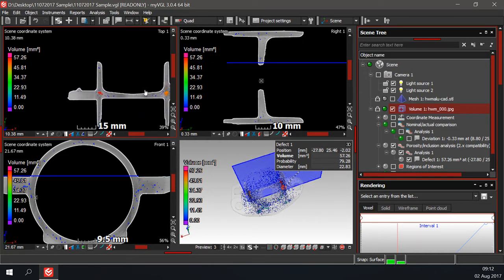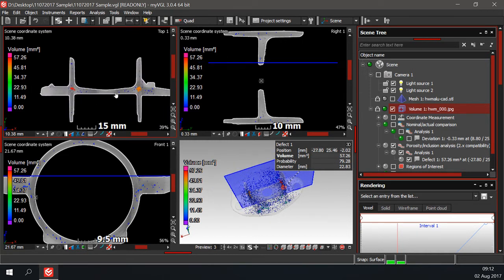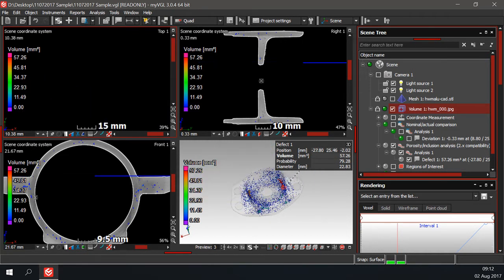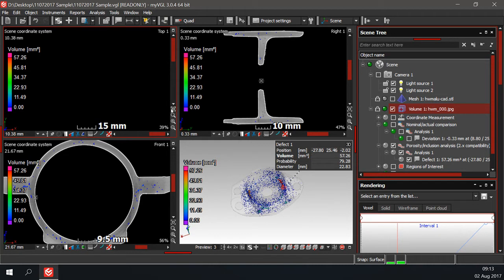A small tip: in case you lose your sample in the 2D view, you can double click or click the focus selected object box and the sample will jump back into view.